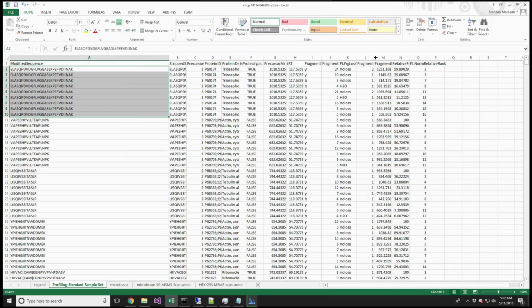And then fragment charge, fragment MZ, and then the library. This is the library, the spectral library part. This is the relative ion abundance, and it looks like they're actually for relative ion abundance. No, I guess they are normalizing to 100, maybe. I don't know. Well, yeah, because you can see that most of these things have a value that's 100. So that means they're normalizing the most intense ion to 100.